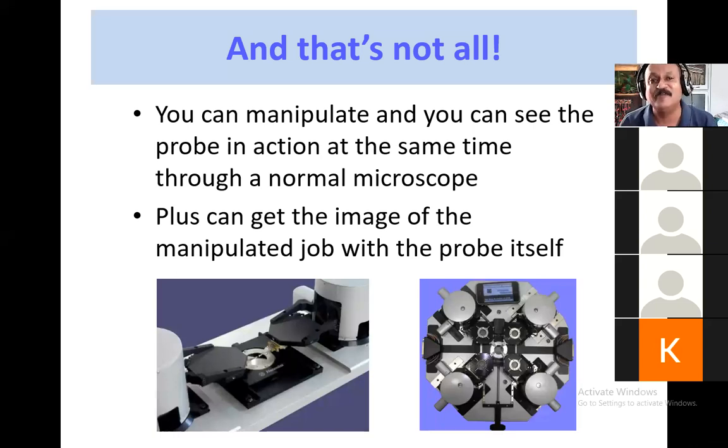And now I'll add one important bit of information here. What the four probes are doing is, probably one of the four is a magnetic probe, in the sense that this particular probe is able to determine the magnetic properties of your sample. Try to understand this. One probe is detecting the magnetic properties of the sample. One probe is detecting some other physical property, maybe the conductivity of the sample, whether it is conducting or non-conducting. So different probes are doing different kinds of actions, different kinds of analysis.